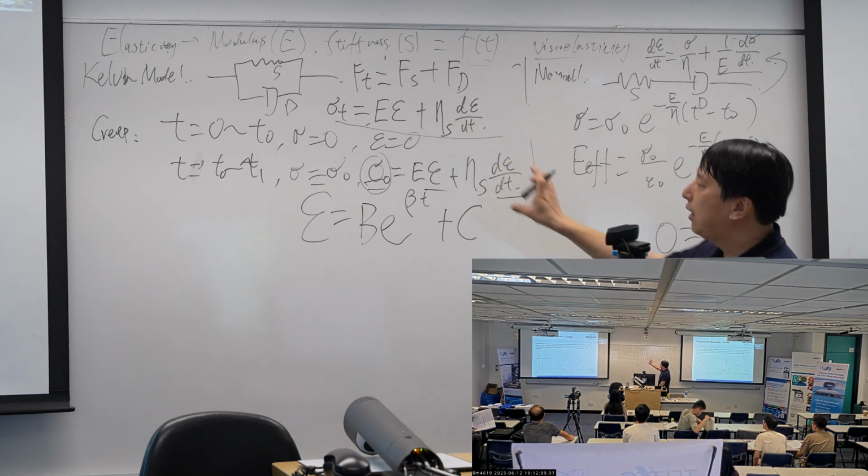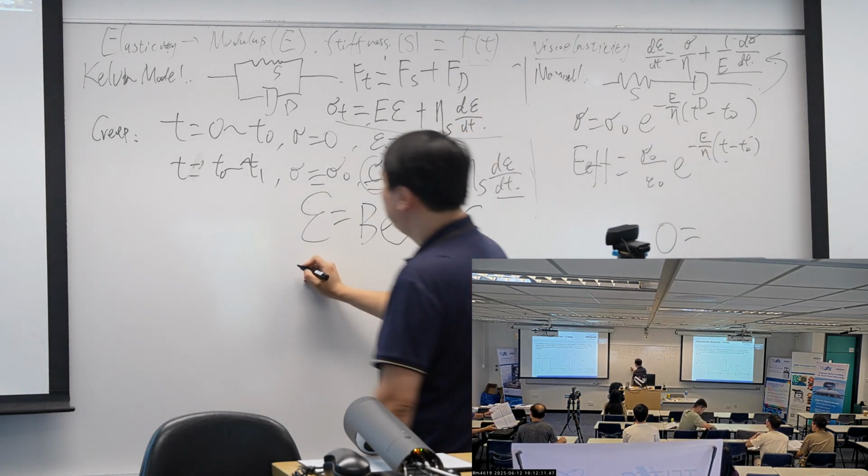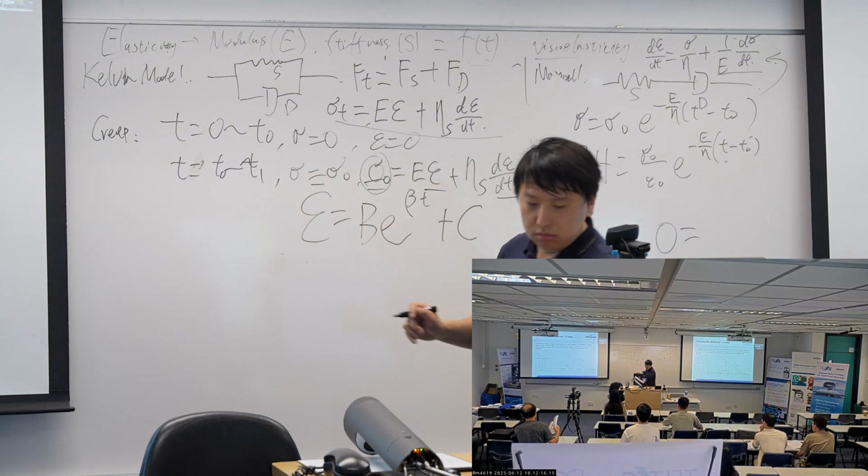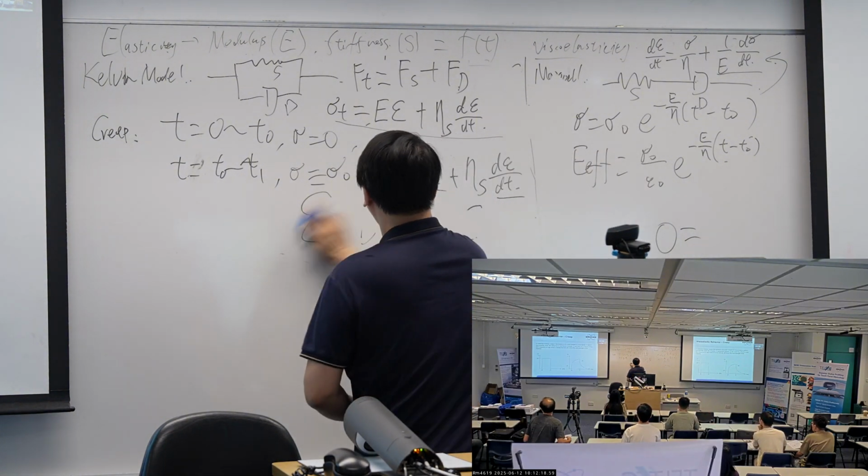So I put it back in. So that one should be sigma. Write it down small.